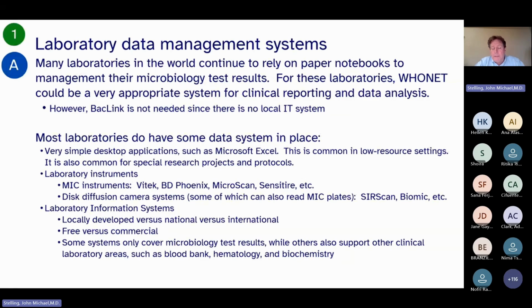However, many laboratories, I think most laboratories in the world, do have some kind of data system in place. Some of them are very simple. Excel, Microsoft Access. This is especially common in low resource settings where someone in the lab or someone in the country makes an Excel template for data entry. It is also common to use Excel in high resource countries if they have a special project, a research project, a protocol, something for a few months that their lab information system cannot handle. So that's one kind of lab system, very basic.